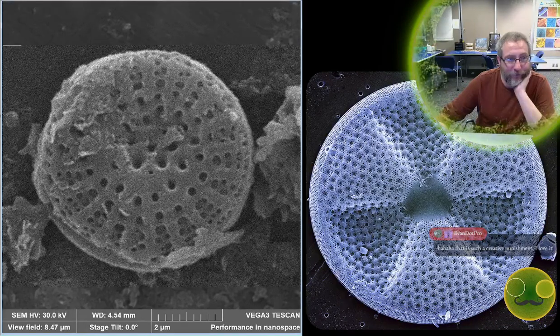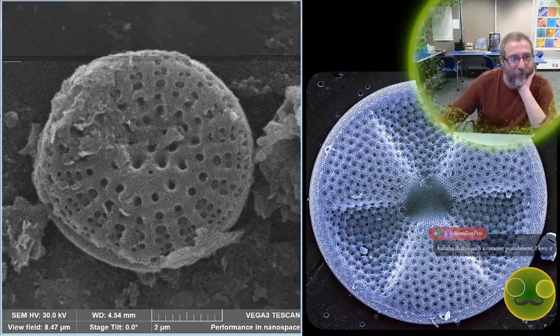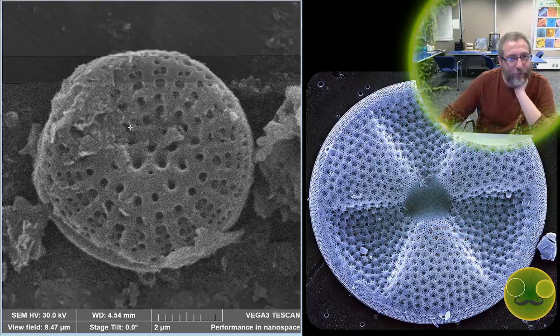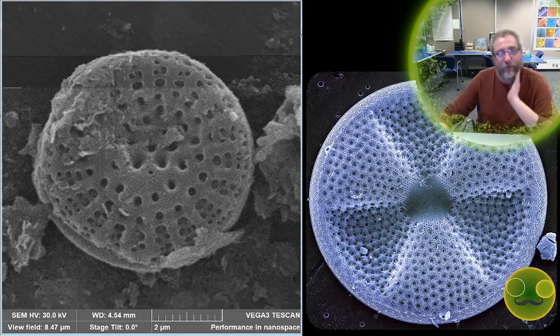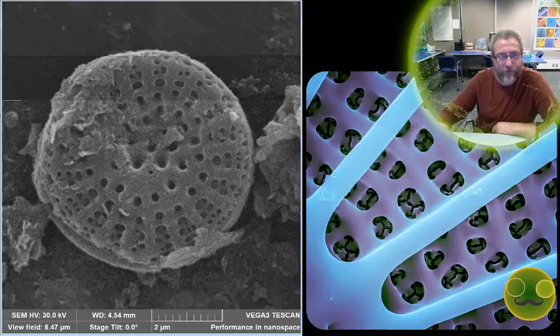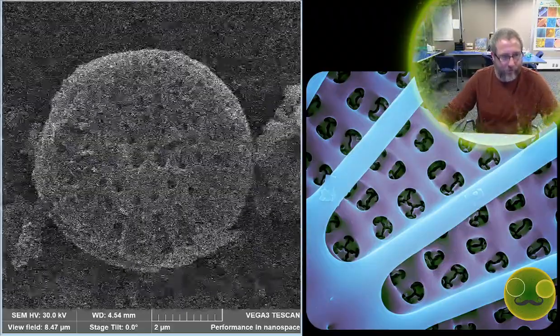Where's the cool little round guy? And my beam intensity is too high. So let's look at it in focus at a smaller beam intensity number. And perfect, it looks really sharp. So speed 7, beam intensity 7, and then I'm just going to zoom in a little bit.